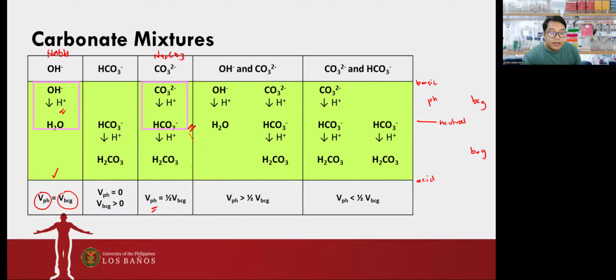Ayan. Then, sa second flask mo, gumamit tayo ng bromcresol green. Then sa bromcresol green natin, originally, what we have is carbonate ion pa rin. Tama? Then, as you add your standard acid, it will convert all your carbonate ions to bicarbonate ion. Then, again, as you continuously add your titrant, yung H plus natin, there will come a point that you will reach the bromcresol green endpoint, which is yung yellow-green color natin.